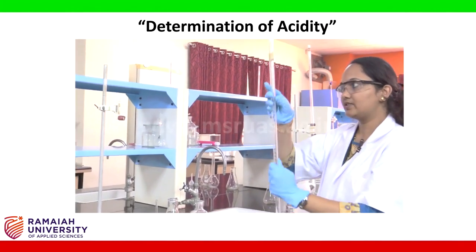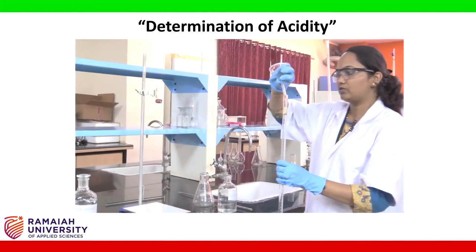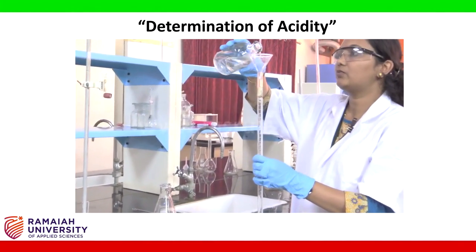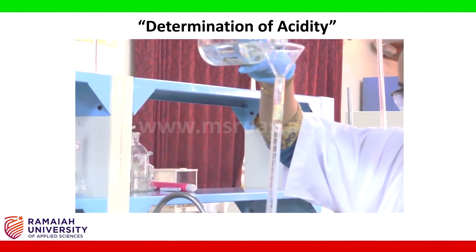Once the burette is rinsed with the sodium hydroxide solution, we have to take sodium hydroxide in the burette for titration.